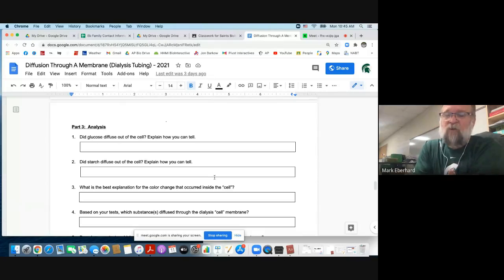Normally, we let it sit for 24 hours, because there's usually only enough time in a class to get it set up. Then we come back the next day and get the results. Normally, the first test before we let it sit is brown, and then the next day it's green, which means the amount of sugar in the tube decreased, but there's still sugar in the tube.